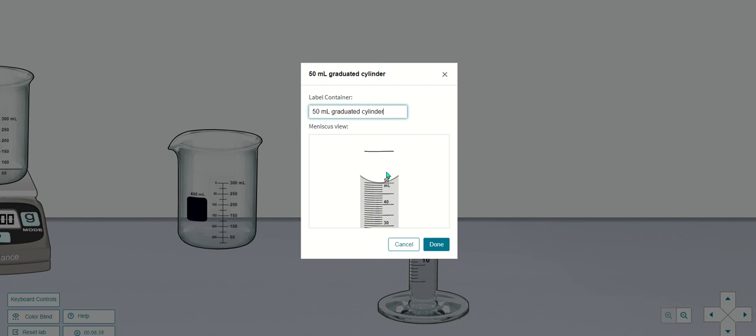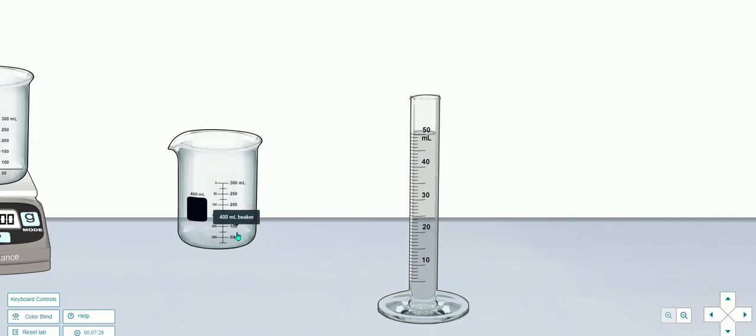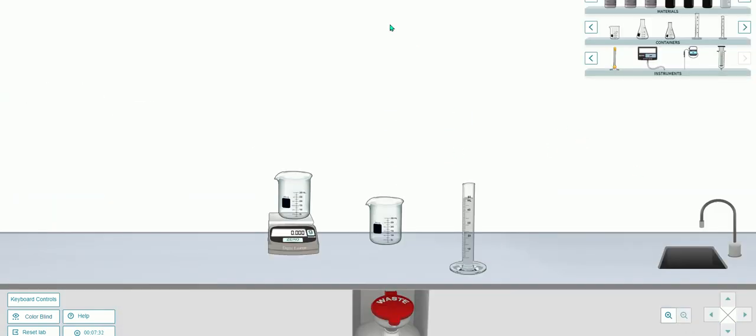You'll notice I make mistakes, but either a student catches it and I just correct it, or I catch it and I'm like, dang it. But anyway, I would record based off the ones place here. Because this is going in increments of ones, I would say this is 50 ml, just like 50 and then ml. Okay, that's how I would read that. And probably the same thing here with beakers. Anyway, that's a short demo on how to measure with beakers and graduated cylinders.